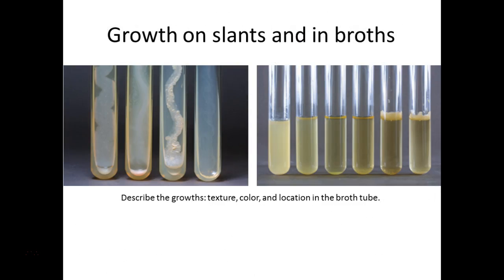So you've already looked at growth patterns for your unknown, hopefully. And there is at least 1 or 2 organisms. This almost looks like there's no growth, right? It's there. It's very translucent. So look closely. I've looked closely at most of these, but if you think you don't have growth, call me over and we'll confirm that you have growth on your unknown slant to start with. So some of them are kind of tough.